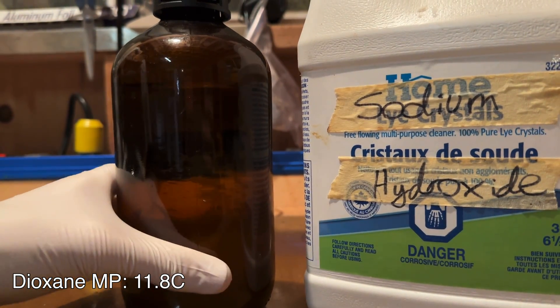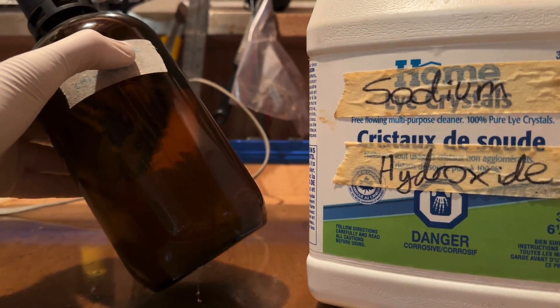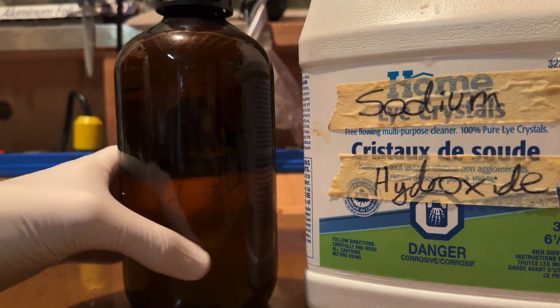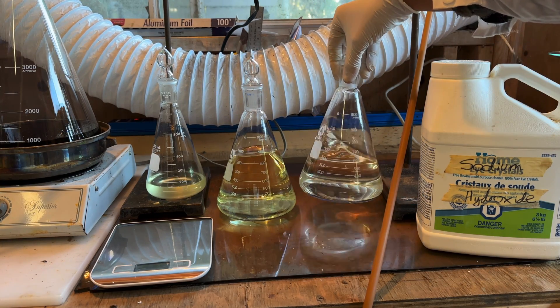Dioxane has a melting point just a bit below room temperature, so as the dioxane cooled it began crystallizing. This dioxane still likely contains a bit of water; however, it is hygroscopic and will not be used for a while, so it will be fully dried as necessary in the future. To dry it, lithium, sodium, or potassium metal can be used to sequester remaining water.